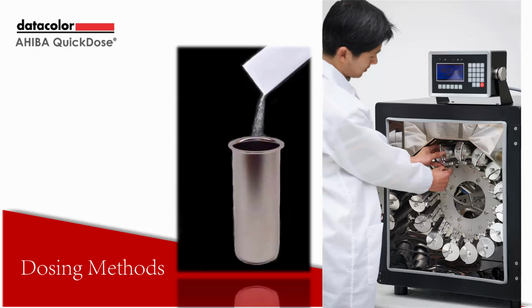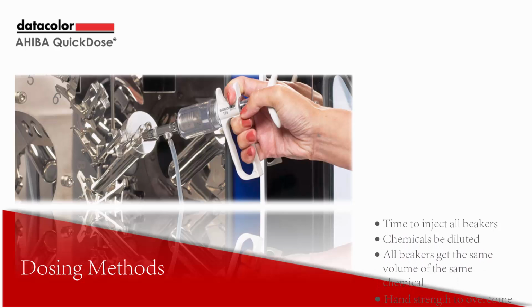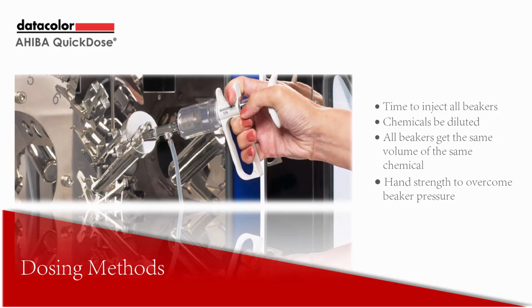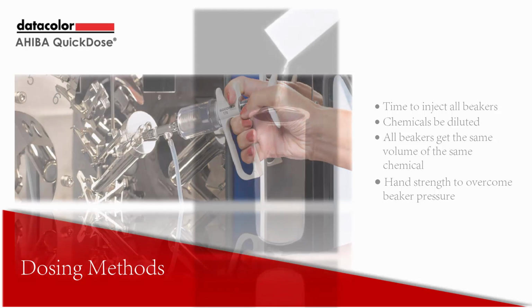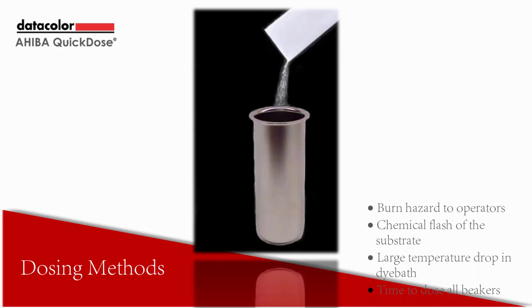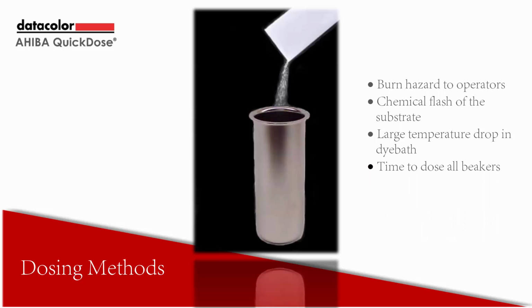The injection systems are time-consuming. Chemicals need to be diluted and all beakers get the same volume of the same chemical. The operator needs hand strength to overcome beaker pressure. On the other side, manually adding chemicals can represent a burn hazard to operators, produce chemical flash of the substrate, a large temperature drop in the dye bath, and it is a time-consuming task to dose all beakers.